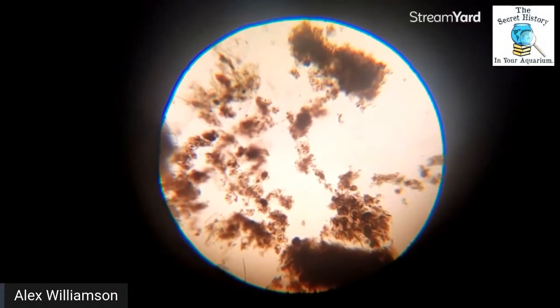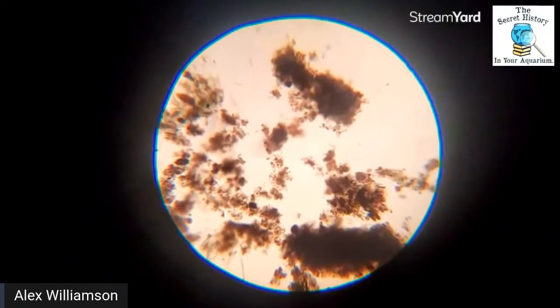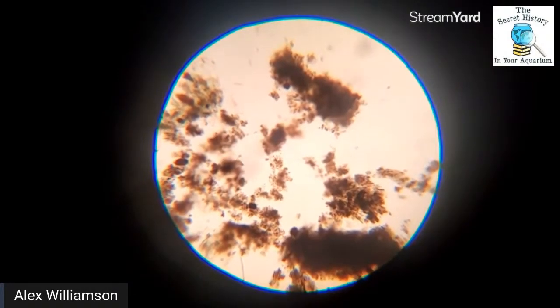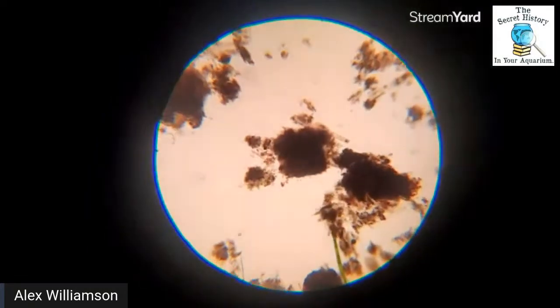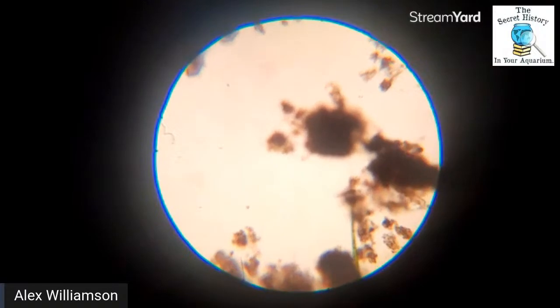All right. No slide cover. Nope. I'm not doing slide covers tonight. We're rolling quick. But yeah, no slide covers tonight because we're going to be checking the depths or different things, basically. And there'll be different critters at different depths. And I like to not smush them.